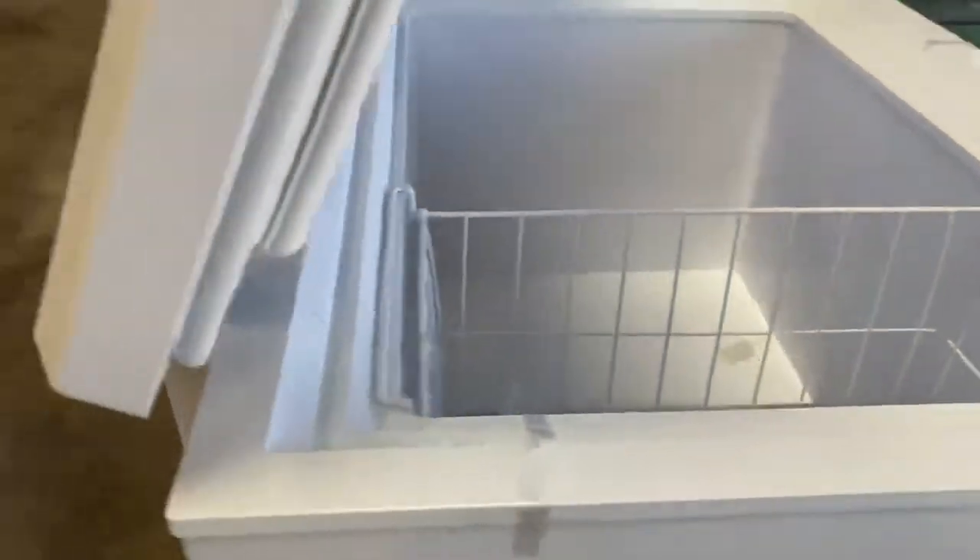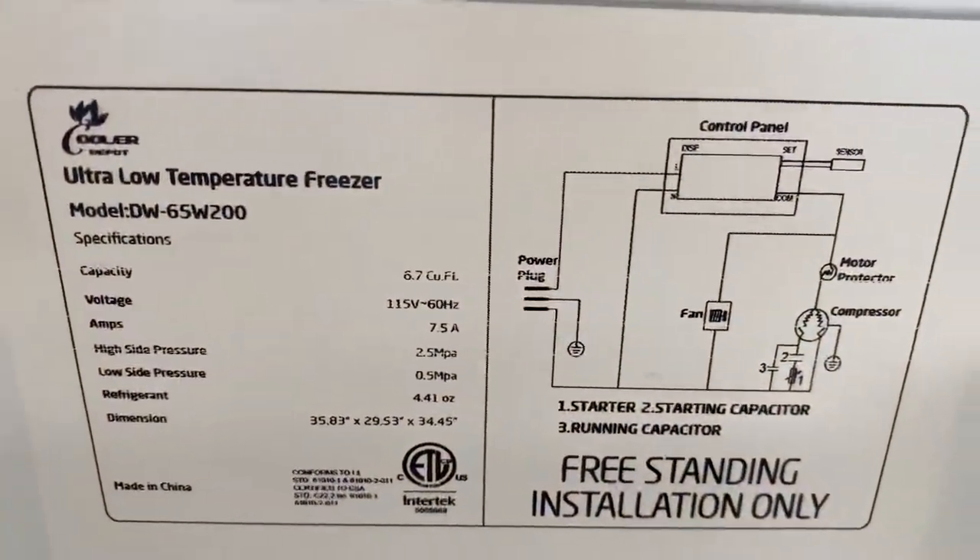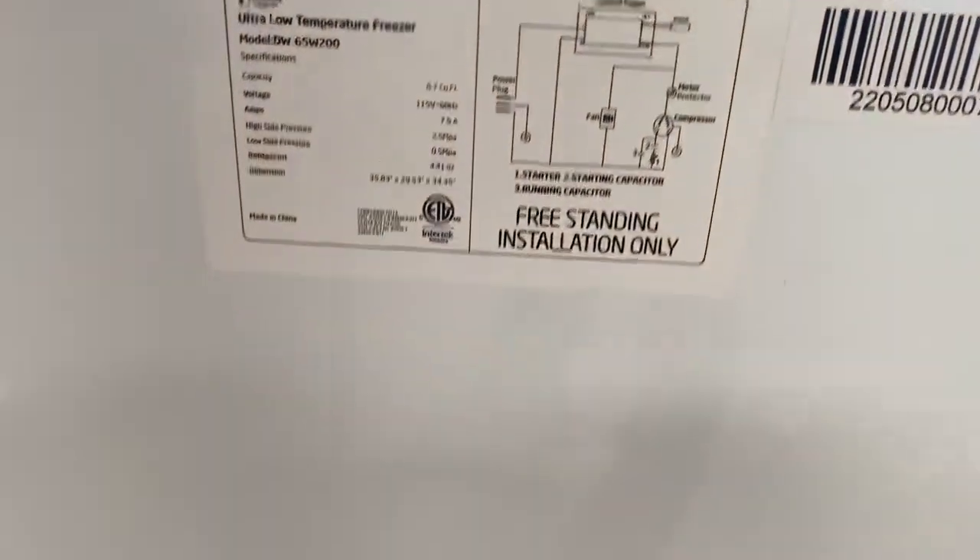All these freezers are going to have a drain. They'll have a drain, and a sticker with all specs is going to be on the back of the unit with certification as well.